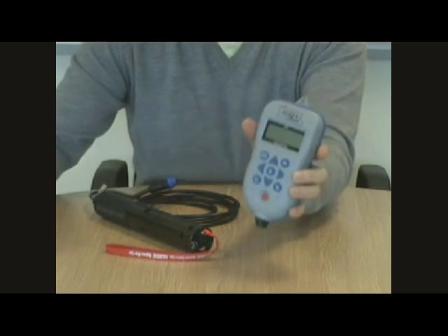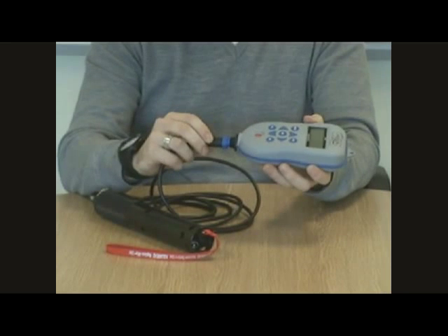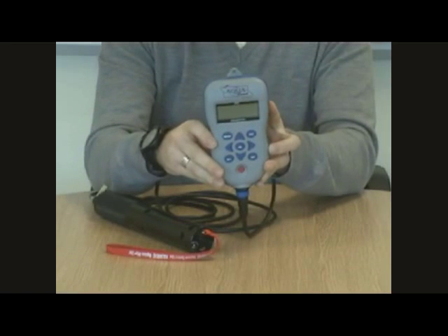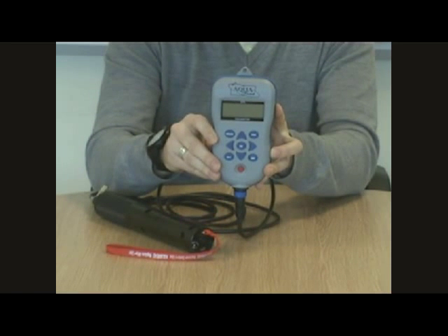Now let's pair the meter with the Aquaprobe. We take our connector, insert it into the connection point, twist until the pair meet and then simply screw together. There we have it, that's the meter paired with the probe. Let's have a closer look so you can see all of the meter's features.